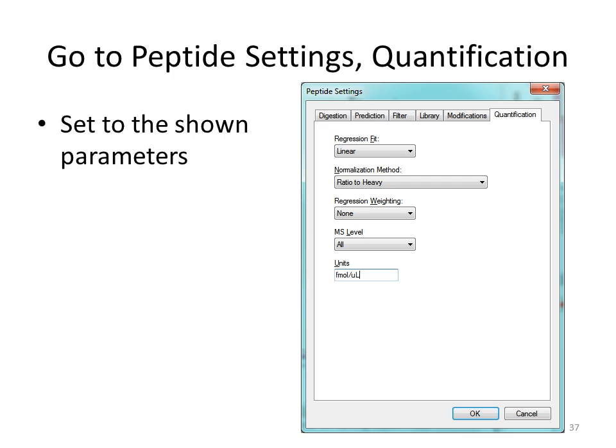By the time you're at calibration curves, if you still have to look at spectral libraries, I don't know, for this kind of work. So the next step after you have it open would be to go to settings and then peptide settings and click on the quantification tab that's shown here and set the parameters as shown. Some of you, I may have done this before, and if I did, it might be saved in the Skyline settings, but some of you might have to do this.